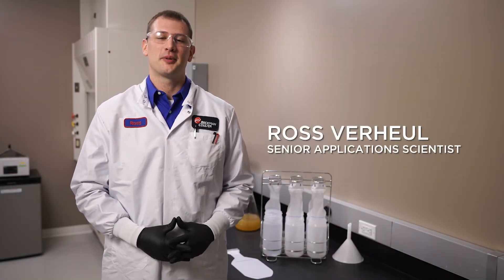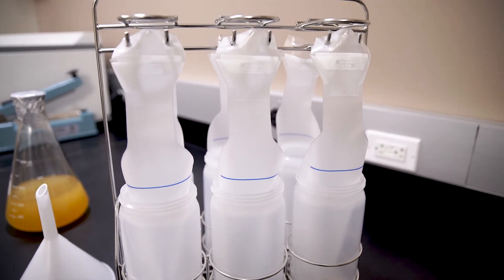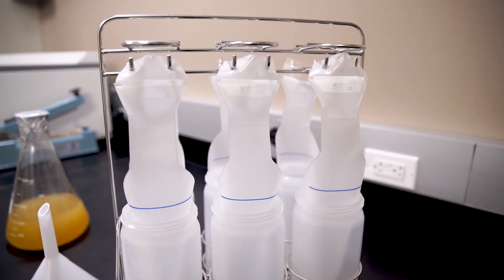Hi, I'm Ross Rahul, Senior Application Scientist at Beckman Coulter. Today I'm going to walk you through using Harvest Liners in your lab. Harvest Liners provide a convenient method of loading, recovering, and storing samples. Let's get started.